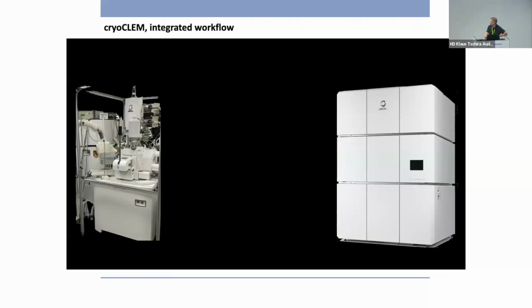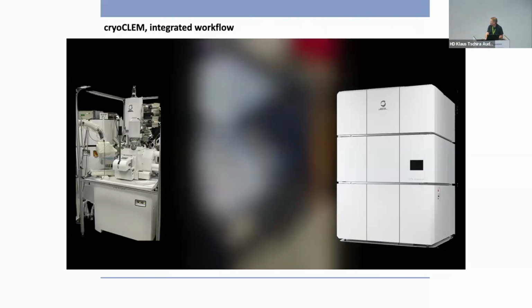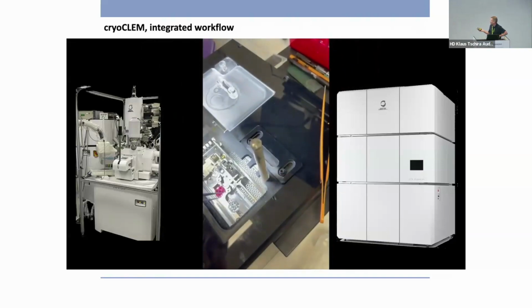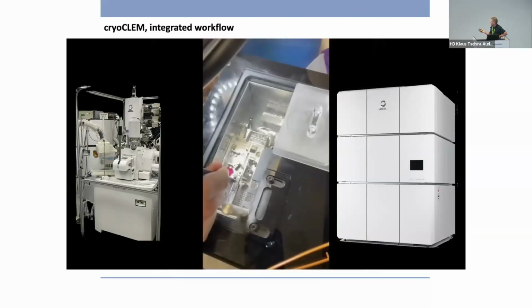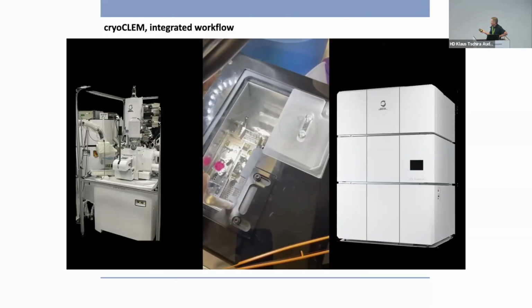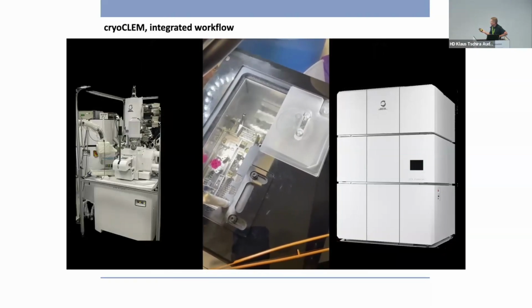Okay, and just to show you the workflow with correlation, is this going to play? No, it's not. Yes, it is. Okay. So the FIB is here, Cryo TEM is here. Again, this instrument can be highly configured with a wide range of cameras and detectors.